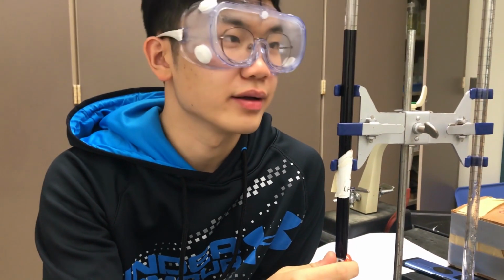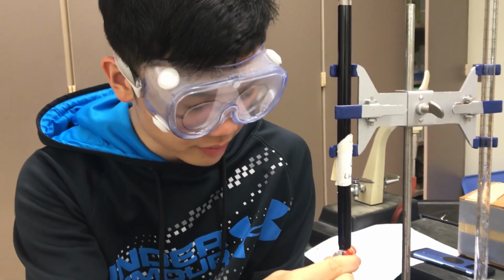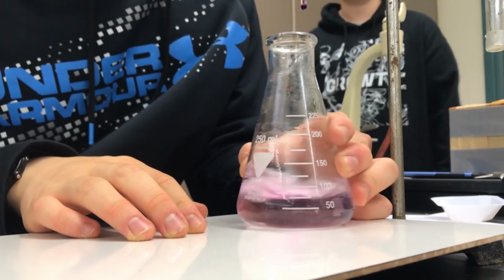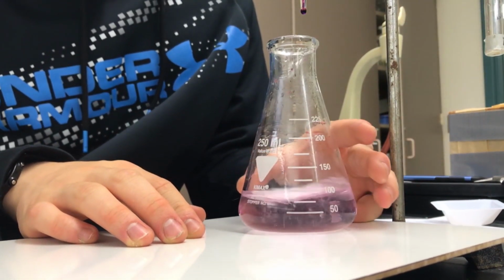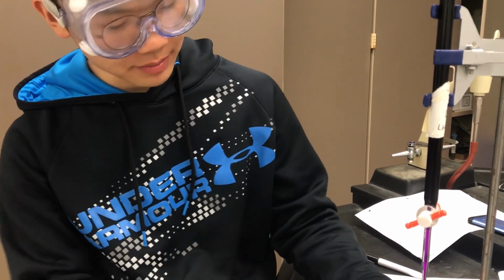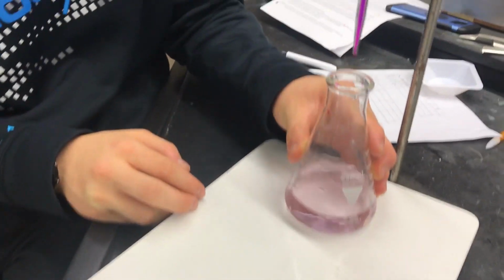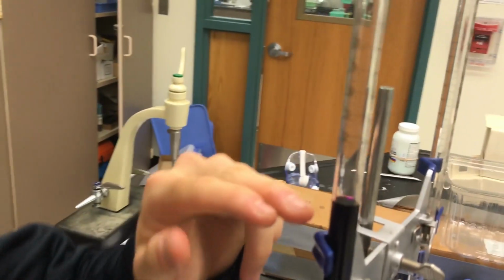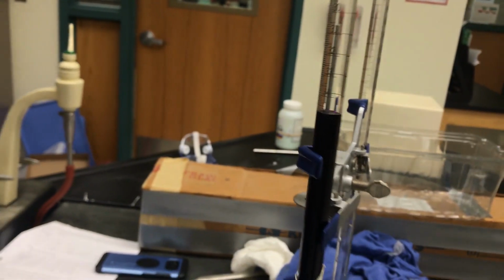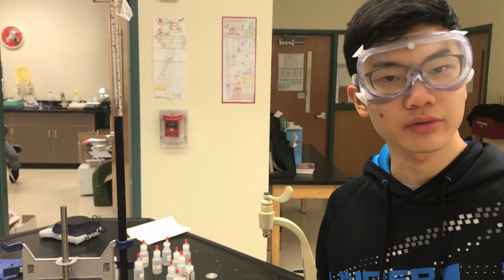Oh hey, it's been a while. Now that we've used about 25 milliliters of stock solution, we should probably slow down. Oh, that's great. Alright, so this is just about perfect, as the lightest pink you could probably get. So all we have to do now is record our volume, which is about 34.85 milliliters. We'll be doing this titration accurately 2 more times in order to get the best results possible.